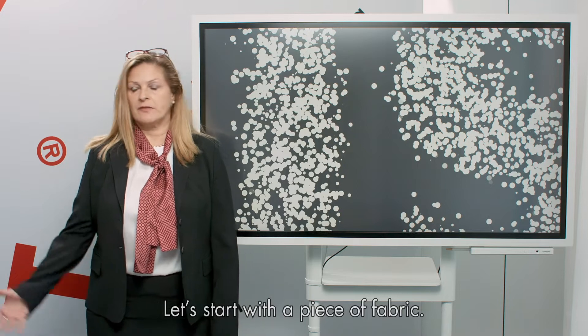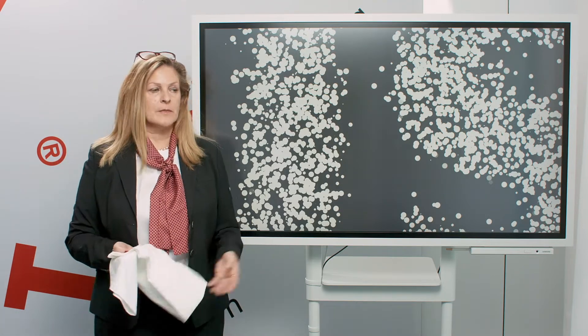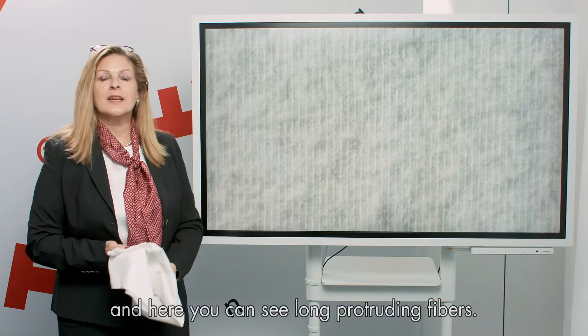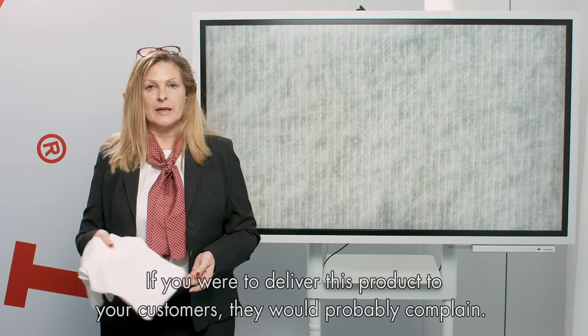Let's start with a piece of fabric. It's a single jersey, and here you can see long protruding fibers. It looks like pilling and leads to a lack of sharpness in the printed fabric. If you were to deliver this product to your customer, they would probably complain.